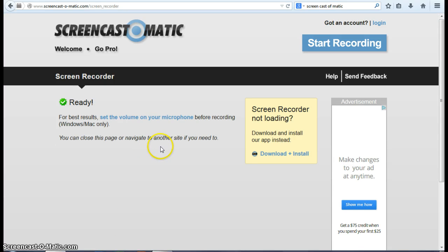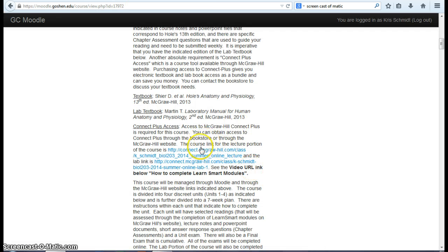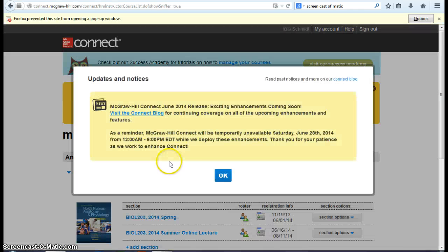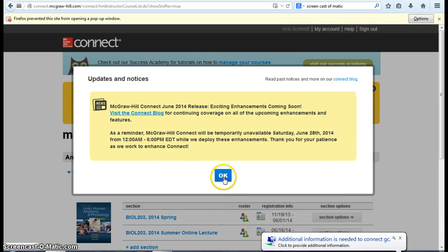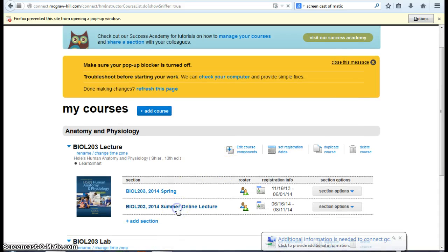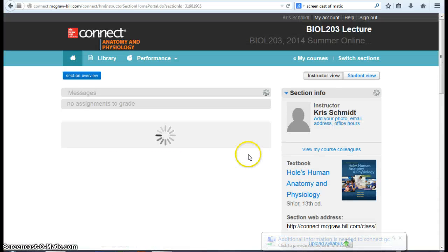Okay, I wanted to show you how to access the Anatomy and Physiology Revealed resources so you can look at some slides. Lab exercises 8 through 11 are really looking at histology. The term histology means microanatomy, so you're looking at the anatomy at a microscopic level under the microscope.